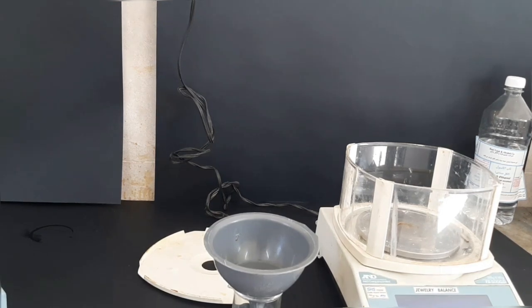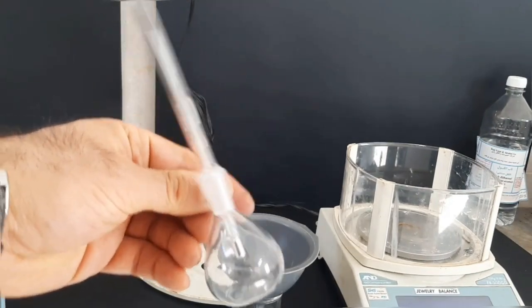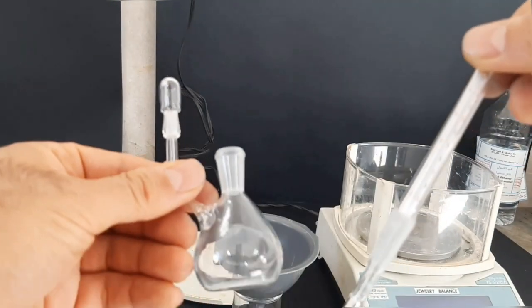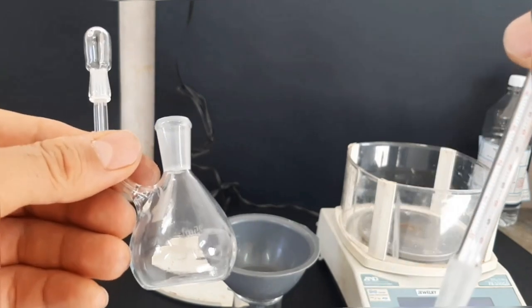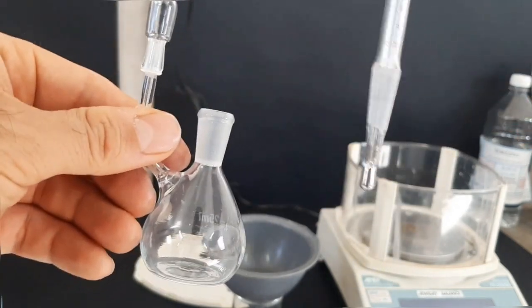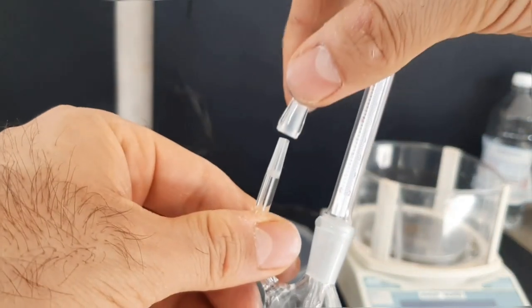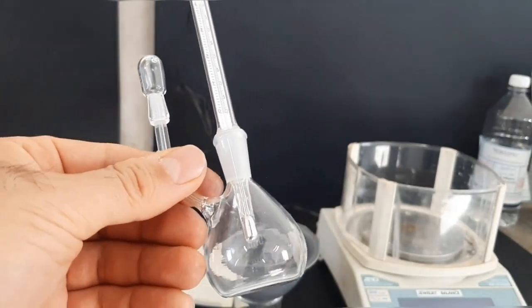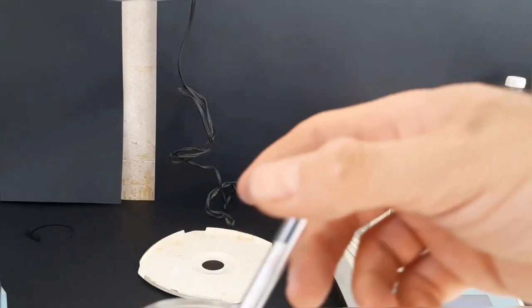So now I'm going to check the purity of our product with a pycnometer. This is a 25 milliliter pycnometer equipped with a thermometer and it is calibrated. If you have the equipment, it's a very good method to check the purity of the product by checking the density. As we have dried our product, the mixture is a binary mixture of ethyl acetate and ethanol, which has recorded data of density, and you can find it on the internet.